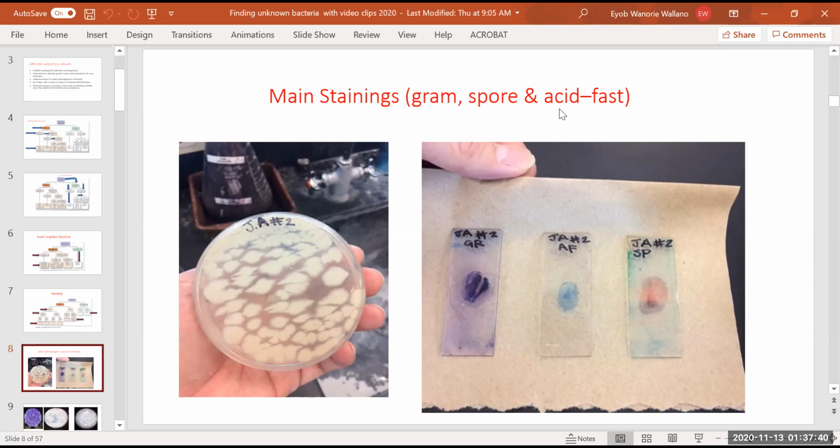If they have done it well. How do they do it? Look now, very interesting. I give them a bacterial culture in a tube, and then they pass it to make a streak. When they do streaks, they write their initials and then their roster number. Nobody else is going to touch this one. Only one student is going to do it.